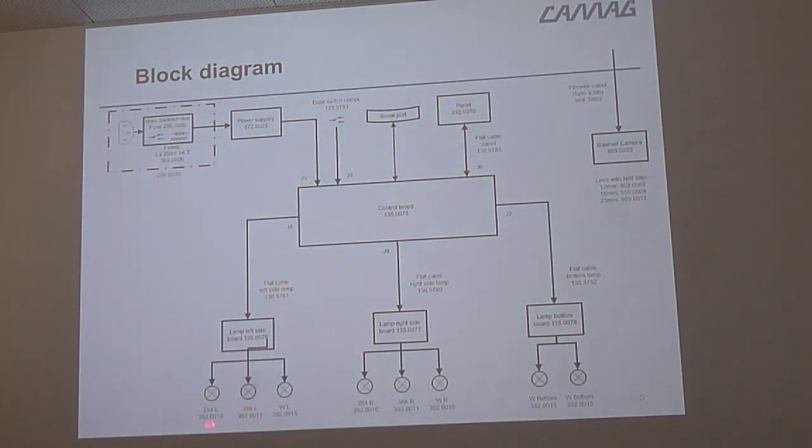And the lamps, there are 8 lamps, 4 white, 2 at 366 and 2 at 254, tubes in the instrument. There is the panel. The serial port is on this control board. There is a door switch and the power supply and the main entry, which is the same for most of the instruments. So this is really not that complicated.